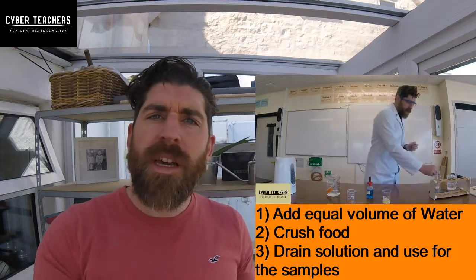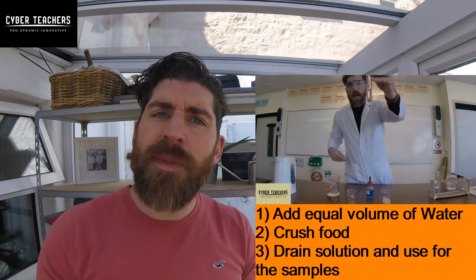First thing you need to know is how to make a food sample. You need to add water, crush it up, and drain some of that water off for testing.